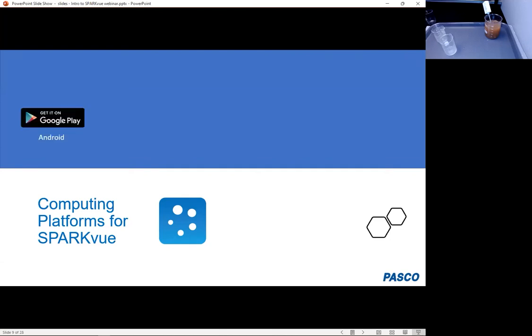So if you have Android phones or tablets, maybe even the Android phone in your pocket, you can get Sparkvue on the Google Play Store. If you have an iPhone or an iPad, you can get it on the Apple App Store. And if you have Chrome OS, like a Chromebook, you can acquire Sparkvue on the Chrome Web Store.